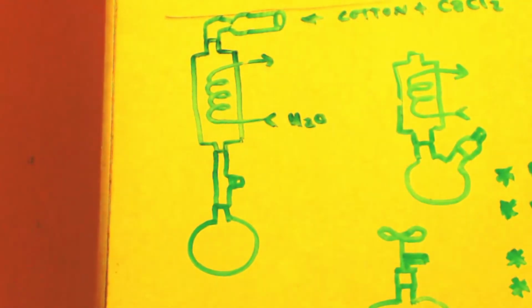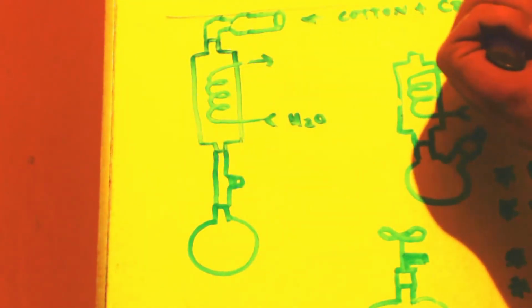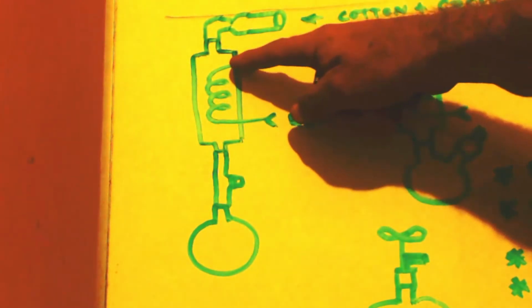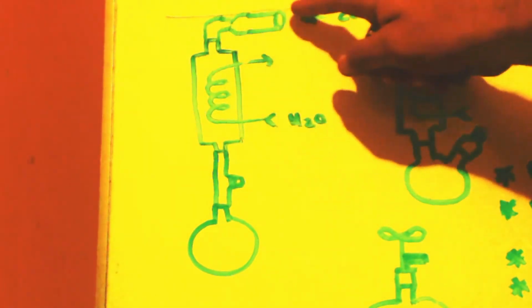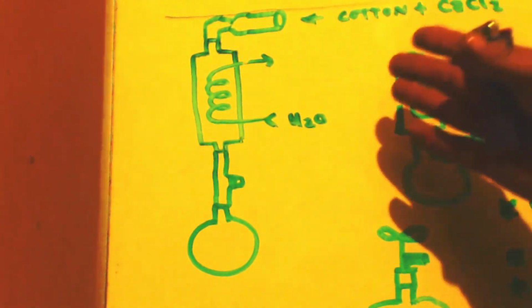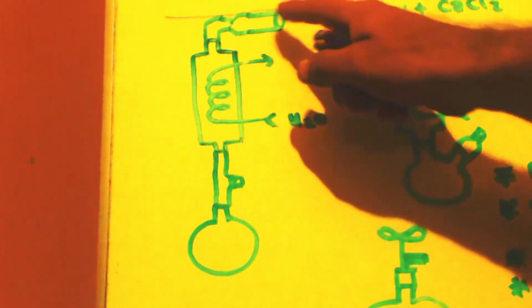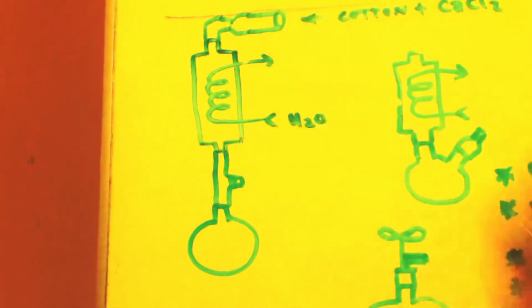Having the drying tube isn't a plug, but it does slow down diffusion, like from the air coming in and the argon coming out. And also, argon is heavy, so it's not going to want to come out as much as it would if it was just regular air. You might be able to get away with just flushing it, filling it up once, and putting your tube on, and your tube would help slow down diffusion. You're only going to reflux for 90 minutes, so.